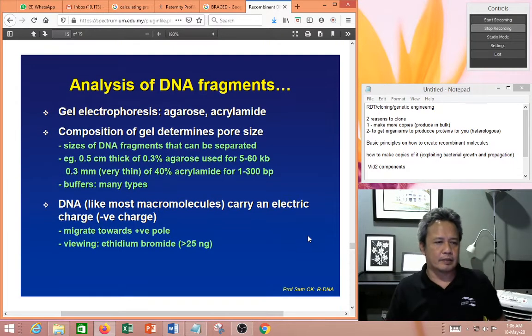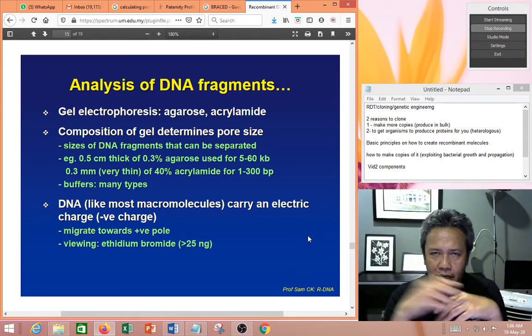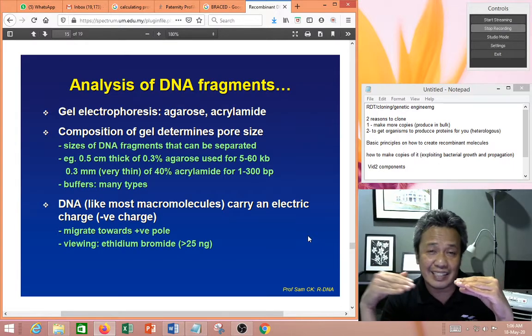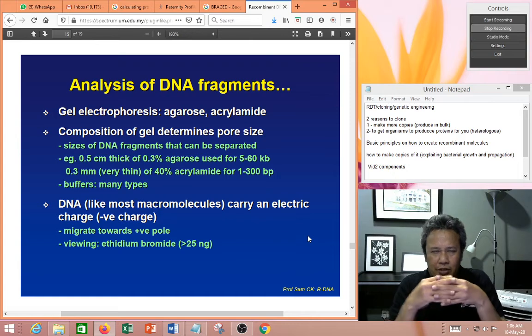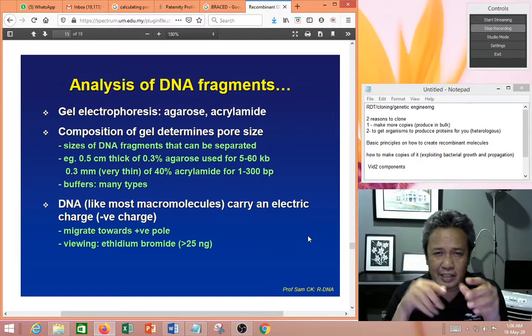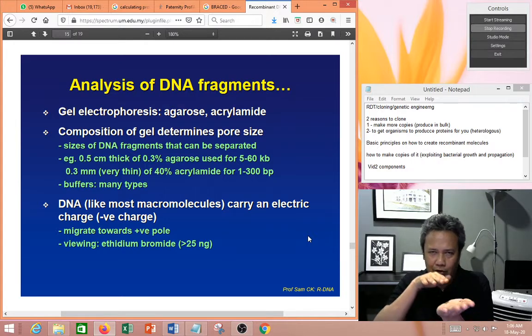Basically, what you do is you have a gel, right? It's like your regular agar gel, and you try to run your fragments inside the gel. Now, these gels have a structure. If you look at the molecular structure of gels, it has a lot of small, tiny pores, or holes, and this is where you try to move your DNA in.